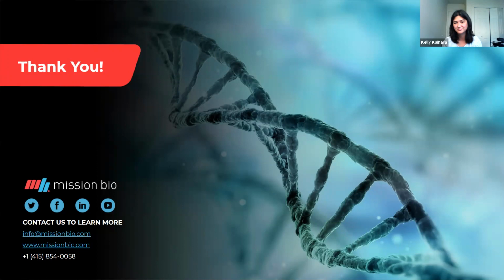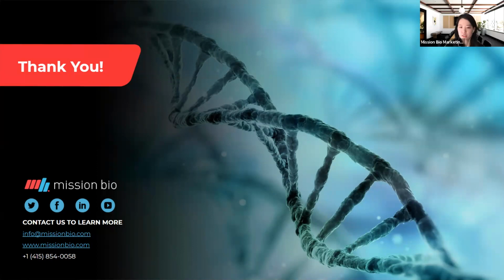Great, thank you. I have another question here. Is the DNA plus protein workflow compatible with fixed cells and intracellular protein staining? So it looks like a question about some sample type.